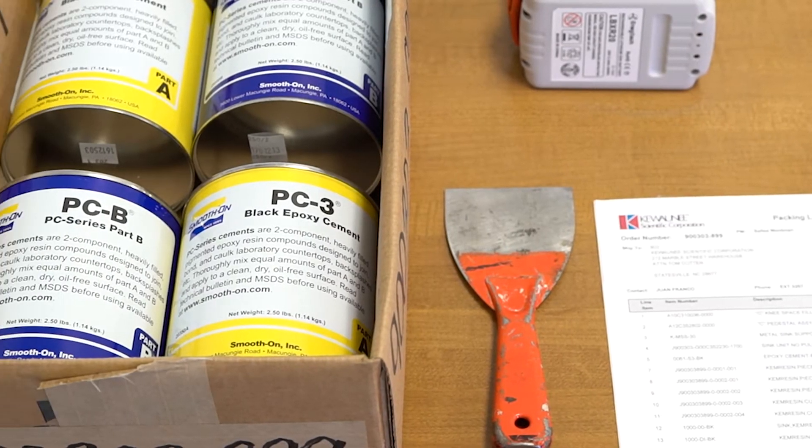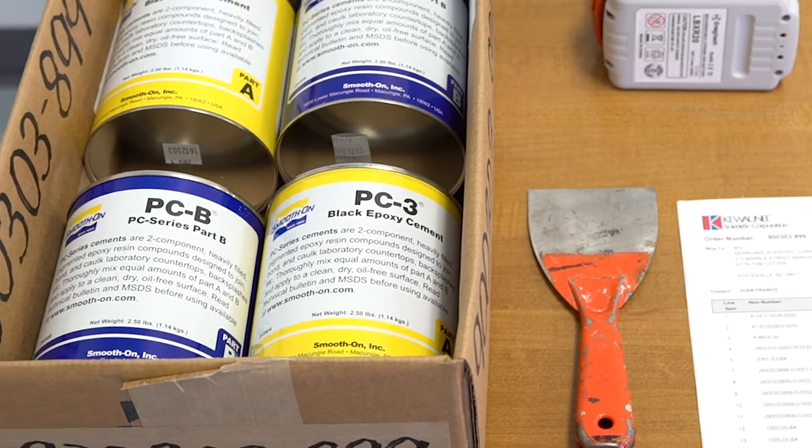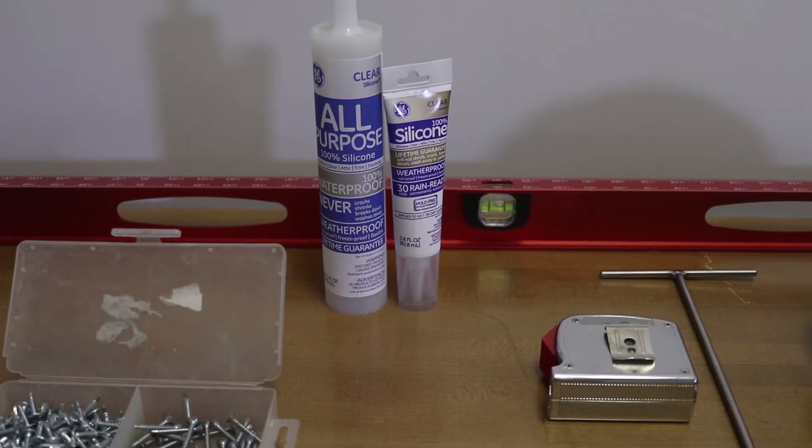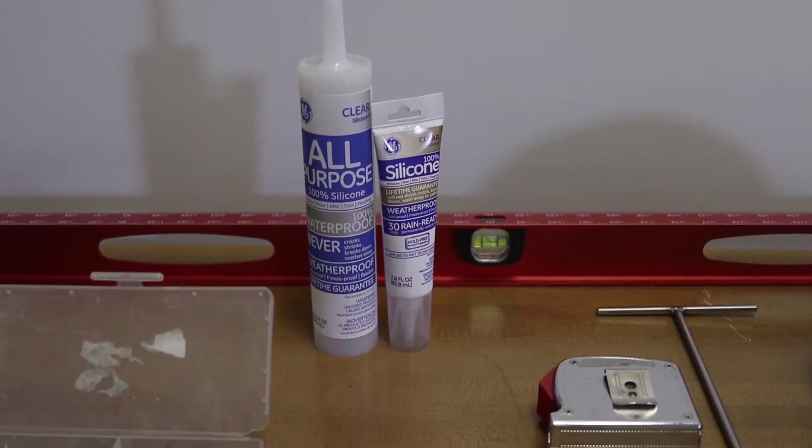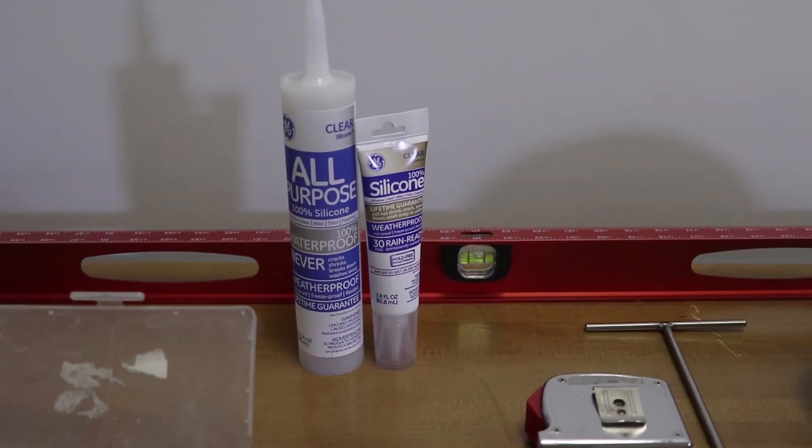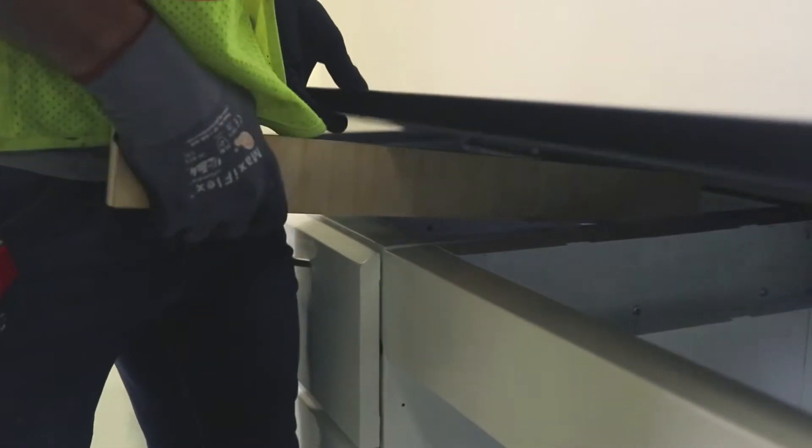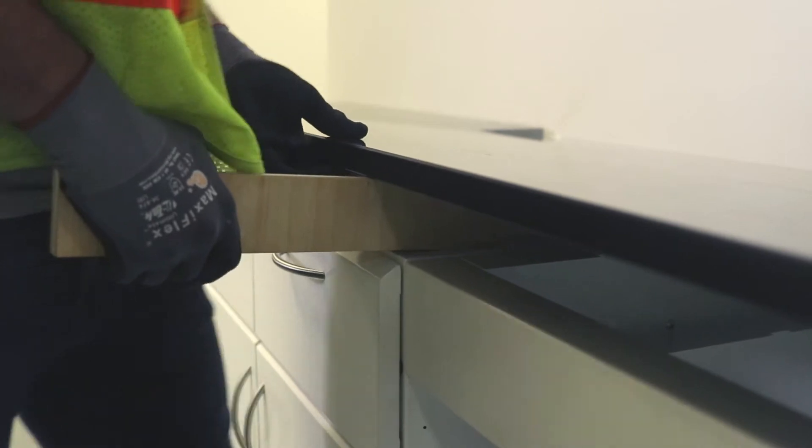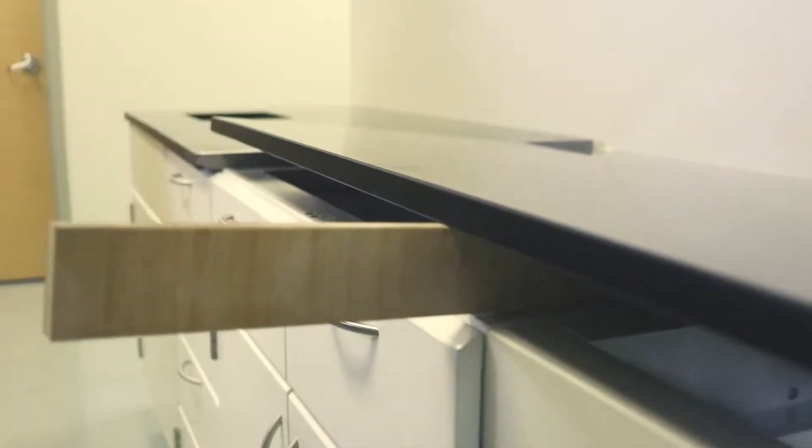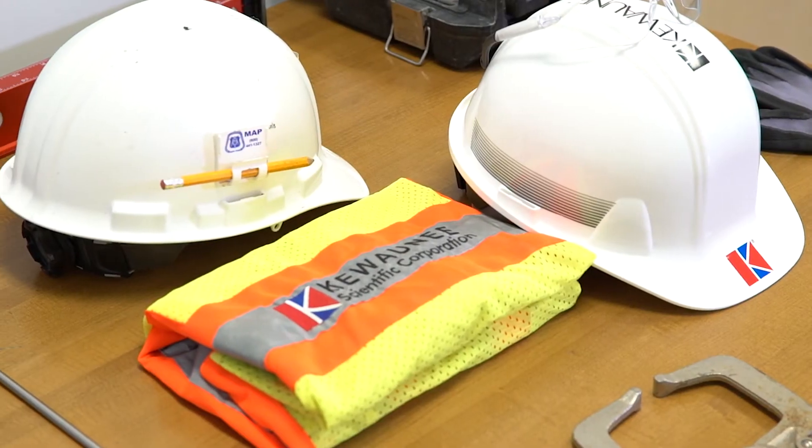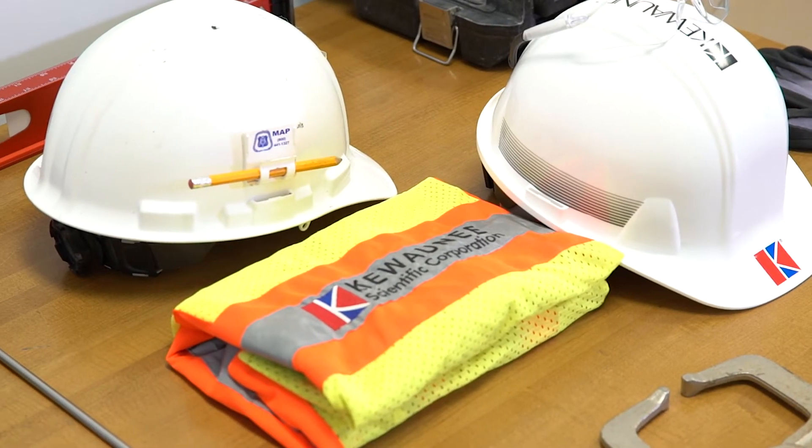2-part epoxy cement, tubes of silicone, scrap 2x4s, and proper safety equipment.